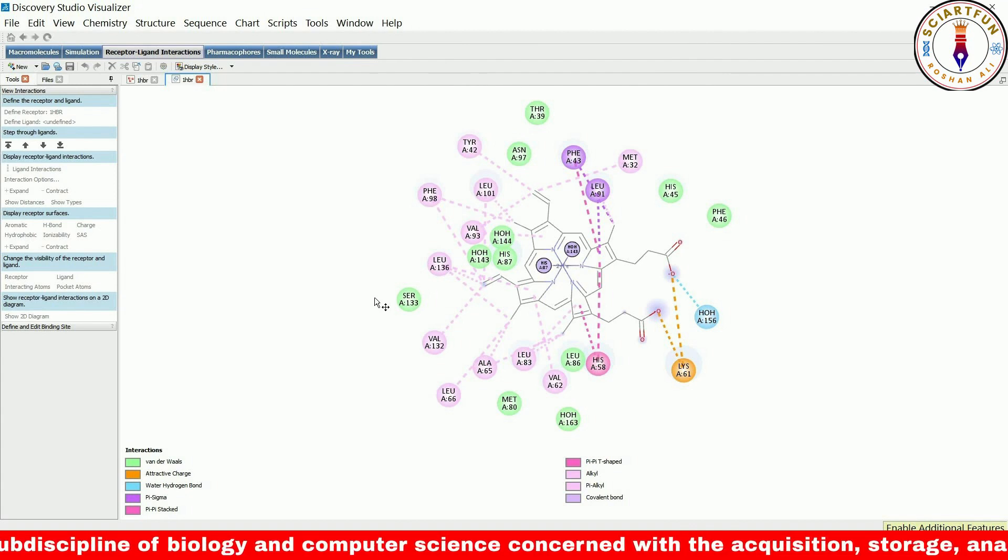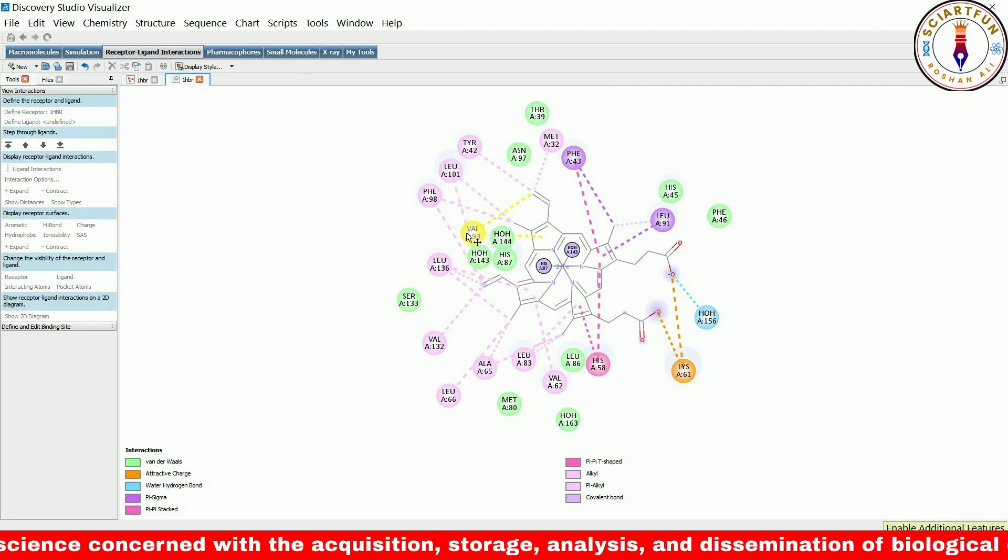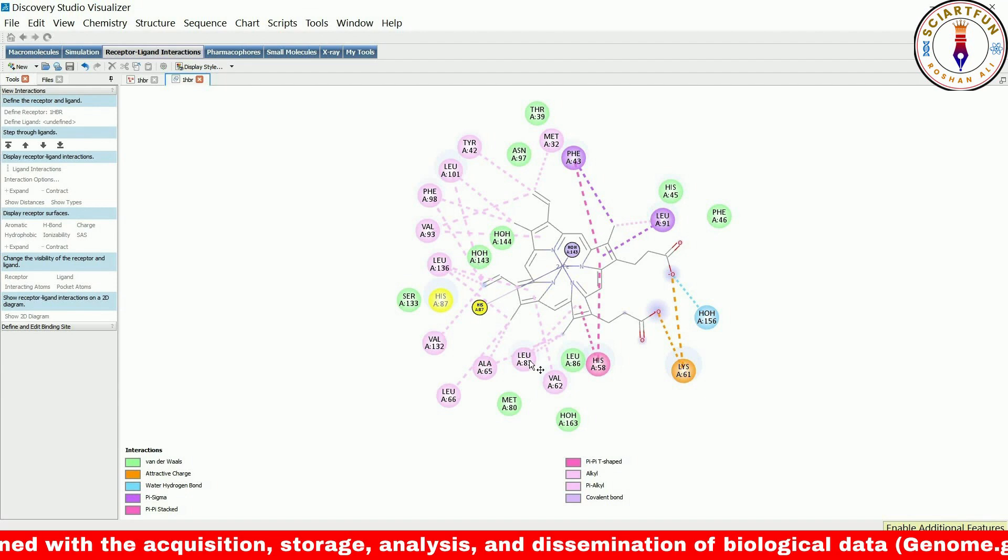The dashed lines represent the interactions. To make the structure more clear, we can rearrange the residues by first selecting them with a mouse click and then moving them while holding down the control plus mouse button.